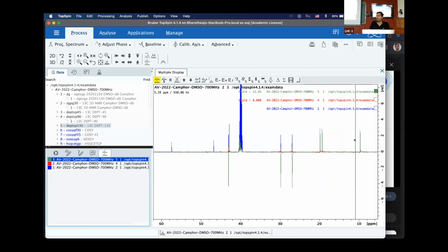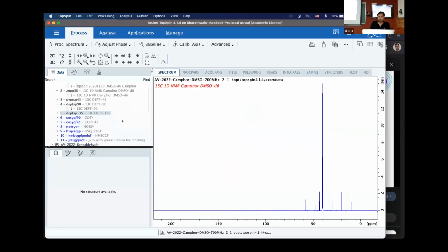What we do not know, let's take the methyl group, for instance. You have 3 methyl groups, and therefore you have 3 potential assignments that are feasible. Correct? Which carbon goes with which proton? How would we get this? 2D NMR. That's correct. Thank you very much. So we are better off doing 2D NMR.